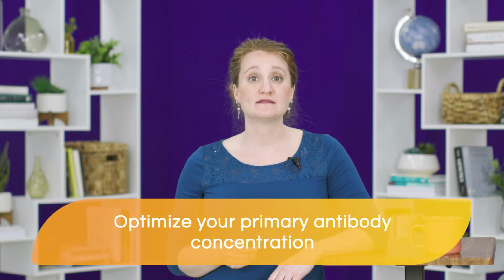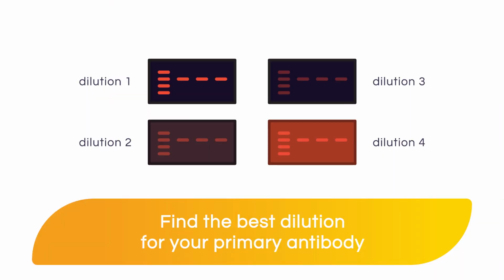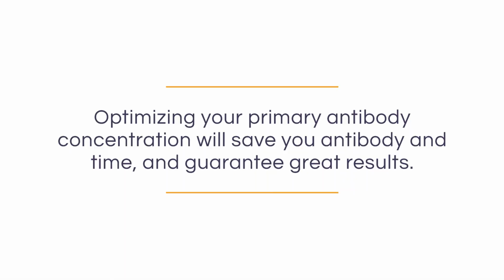It's very important to optimize your primary antibody concentration by trying several different dilutions in order to determine the highest dilution of your antibody that gives you the optimal signal-to-noise ratio. You can start with the dilution that is suggested in the datasheet of your primary antibody, but you will need to still optimize the concentration further. This optimization will save you antibody and time in the long run while guaranteeing great results every time.